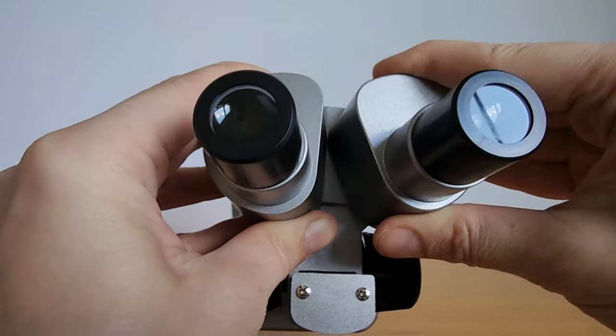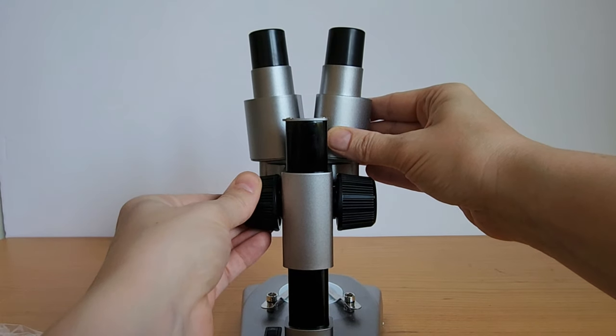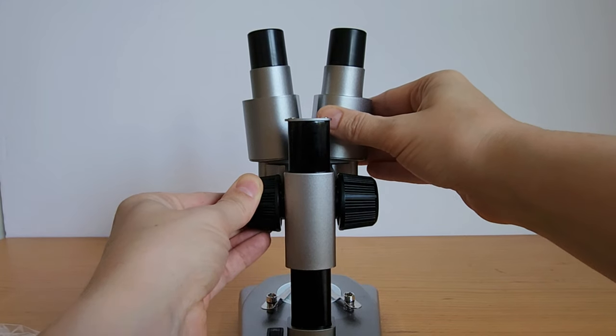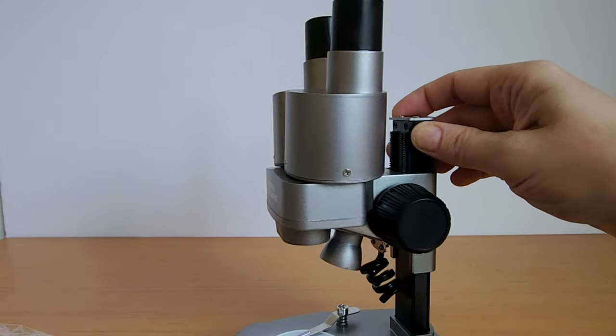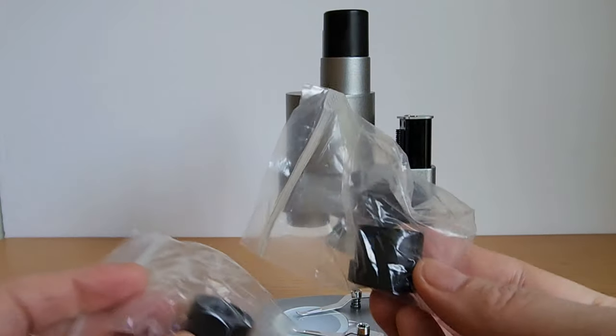It's adjustable at the top and adjustable for you to change your focus. It's great that you can put slides into the microscope to look at different things, and you can also just go get different objects too.